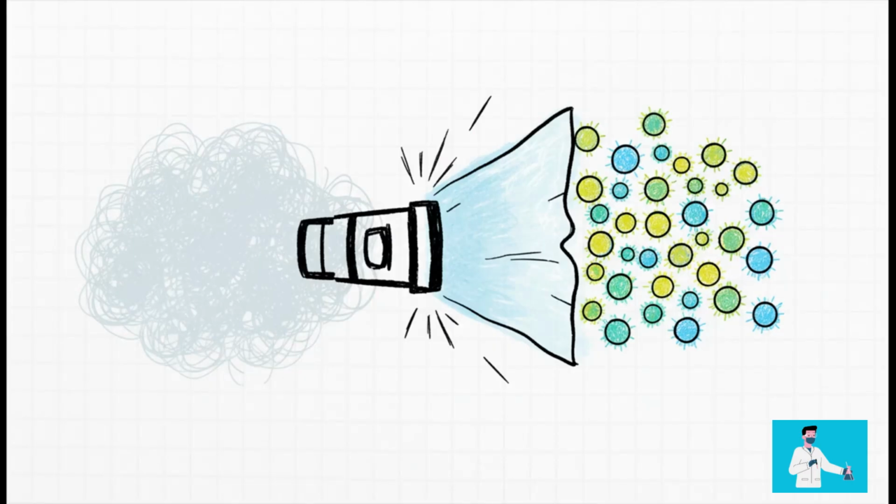And believe it or not, the story doesn't end with electrons. In just the last few decades, Nobel Prize-winning techniques called super-resolution microscopy have found these ingenious new ways to break that old diffraction barrier, but by using light. These methods essentially let scientists watch individual molecules at work inside living cells in real time. It's like combining the detail of an electron microscope with the dynamics of a light microscope. The age of discovery is far, far from over.